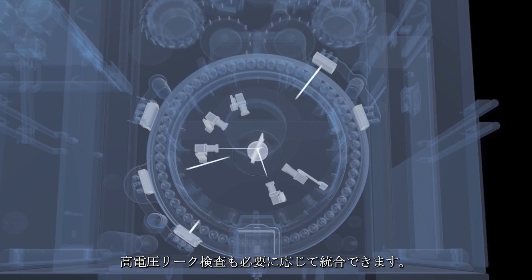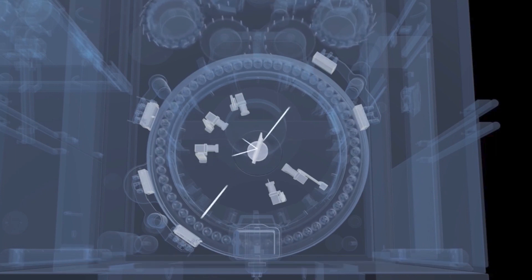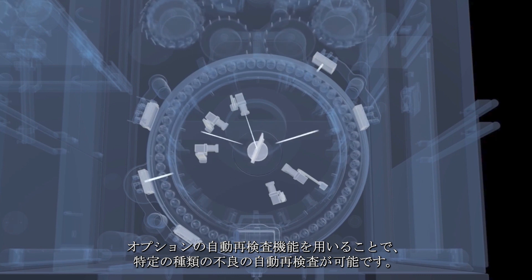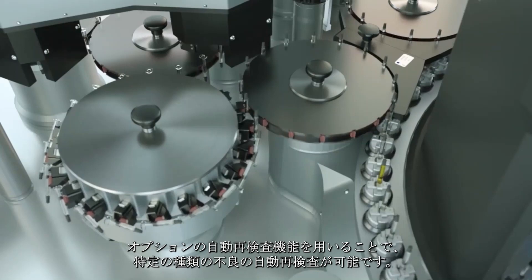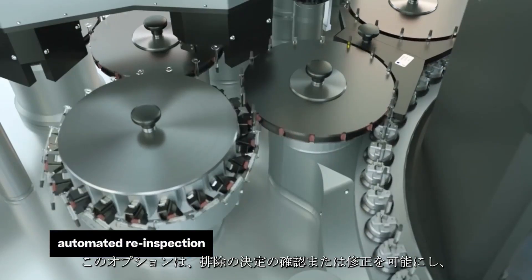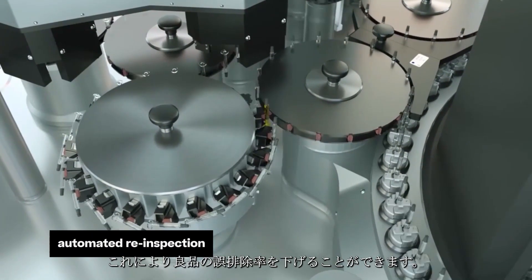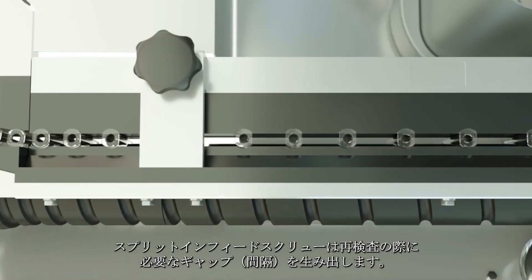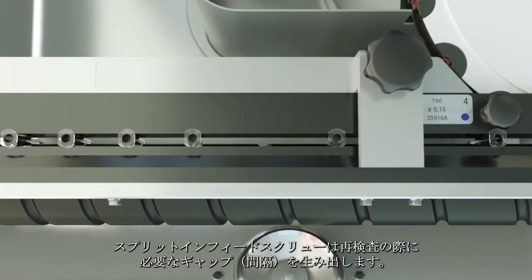High voltage leak detection can also be integrated if required. Via the optional automatic re-inspection, certain types of defects can be evaluated again. This verifies or revises the decision to remove, therefore lowering the false reject rate. The split-in feed screw generates a re-inspection gap.